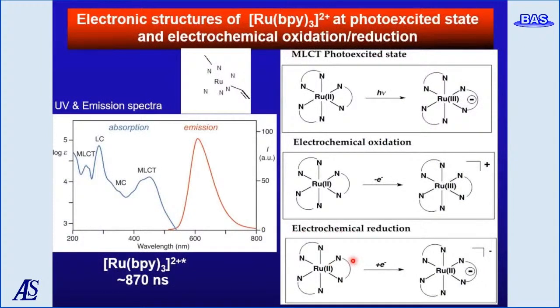Now, the absorption and emission spectra of Ru(bpy)3 2+ are shown in these figures. In the absorption spectra, the pi-star transition of bipyridines and the MLCT transition are observed in the UV and visible regions. The corresponding phosphorescence emission is observed at 620 nanometers. Now consider the microscopic view for the spectral MLCT transition and the electrochemical reduction process.